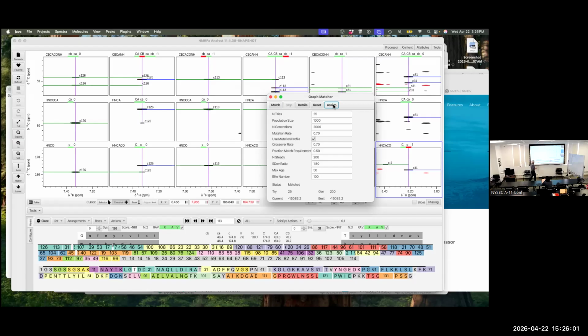Like I say, okay, why did it do a stretch here, and why didn't it actually complete that? So I can click on these and actually go back and look at the data. I can find places where it didn't assign anything.